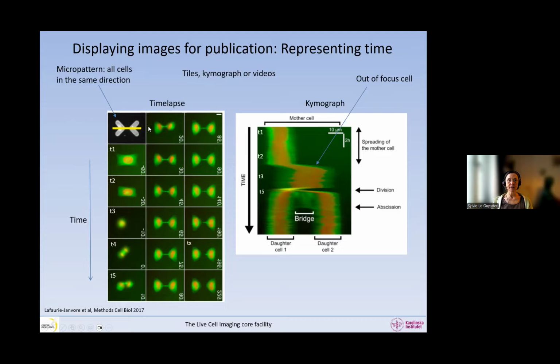So from here, we're going to be in the background. We get into the green part of the image. Then we get into the red part of the image. And then we get into the bridge. And then again, we go back into the background. And this is exactly what we're seeing here. So at time point 1, for example, if we draw this line in the middle, you can see we go black, green, red, green, and black. And this is exactly what we're seeing.